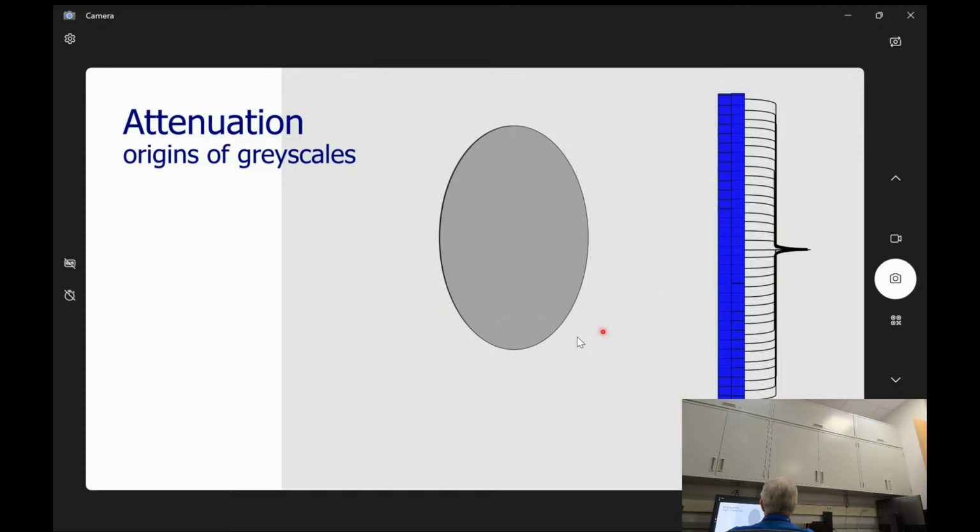There's a scintillating layer, and then there's the detection layer. And that's where we're getting some magnification off the objectives. What's a scintillator? Basically, it's a chemical that will take an X-ray and then re-emit a visible light photon. And that photon is something that the silicon-based detector can see.